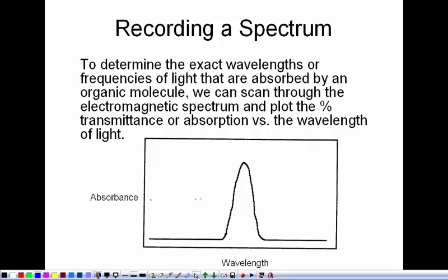If you took analytical, or if you're taking analytical, it'll end up the same way. You use the quantitative aspect of this. We're going to look at the position of the absorbance peak to tell us something about the structure. And so all the spectroscopy techniques will involve some sort of scanning through the light and measuring the corresponding absorbance and looking at a spectrum. Okay, so the peak and the peak position is what we're looking at.